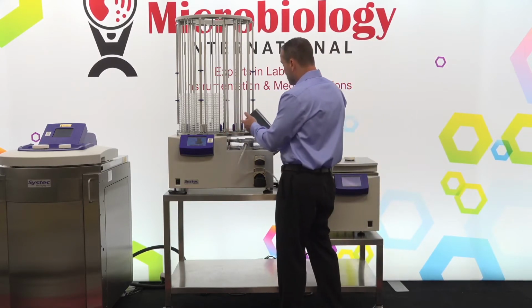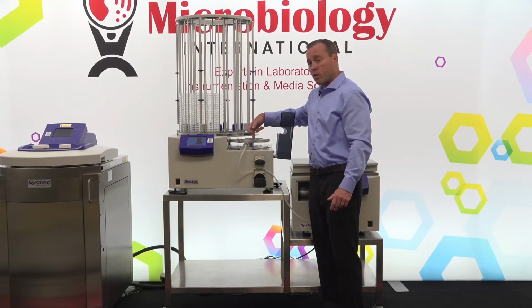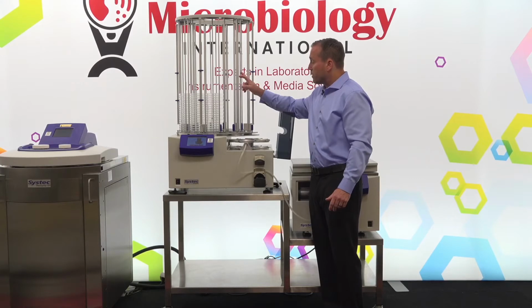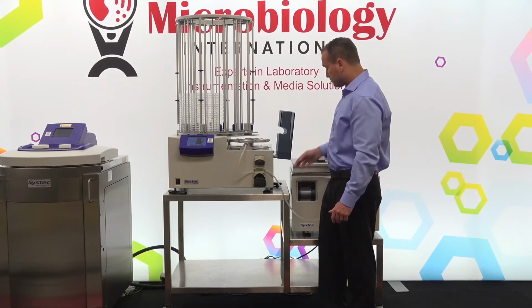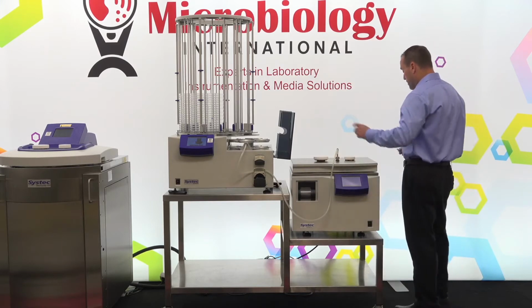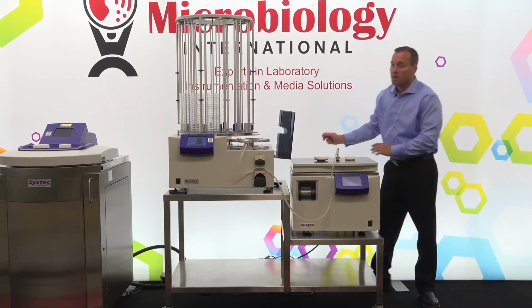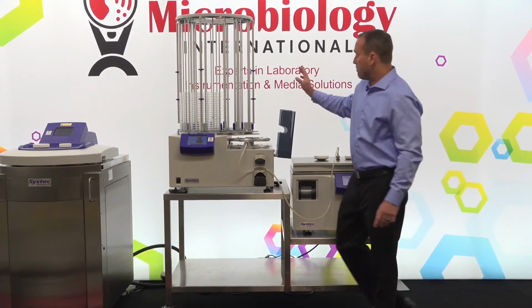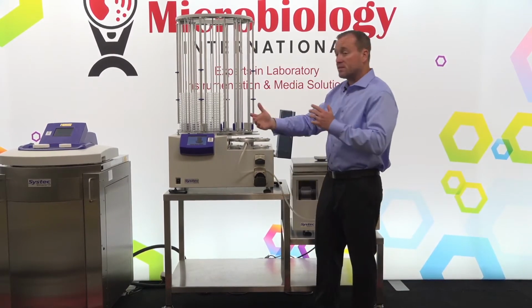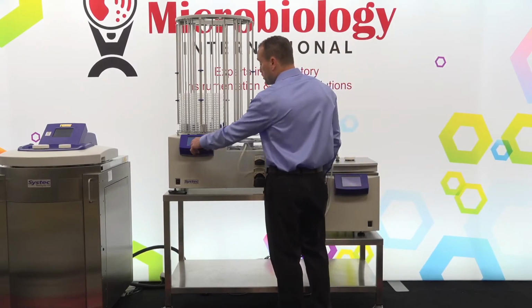The lid on this system can be opened up. The plates will be loaded through into the revolver where they will be opened, and then they will be restacked into the system. In normal operation, the lid would always be closed, but so you can just view what's actually happening in the system, I'm going to put a magnet back here so it's normally sensed, so you wouldn't be able to open this while they're moving components. I'm going to start a cycle.